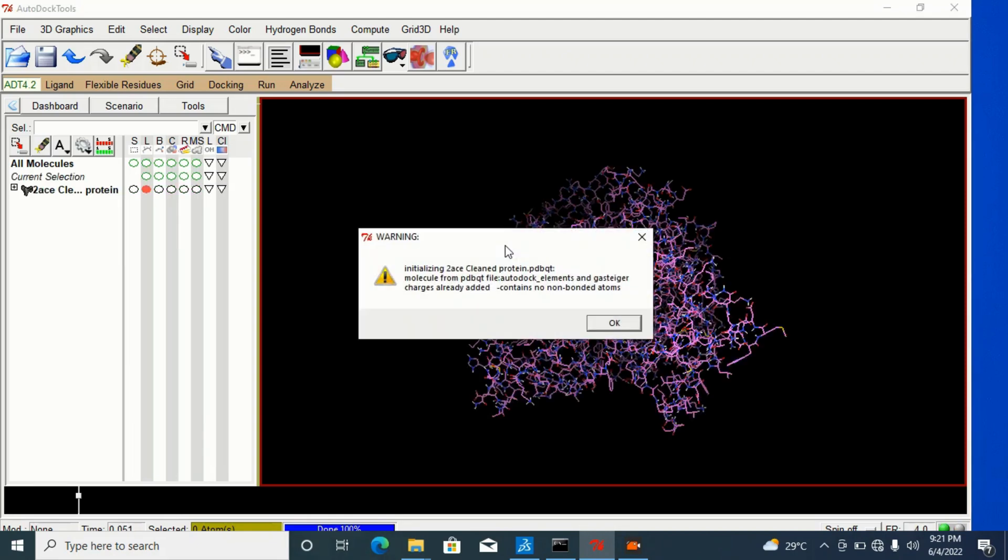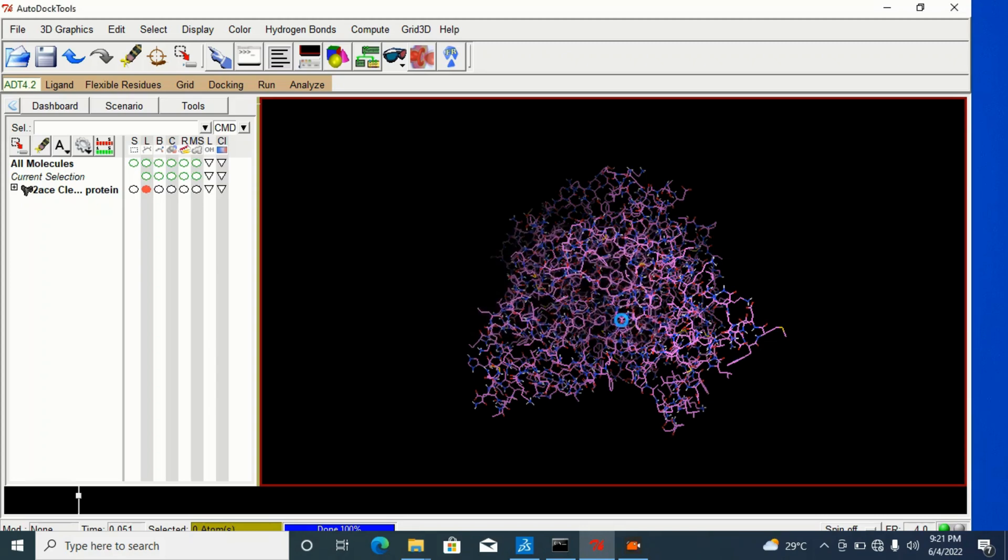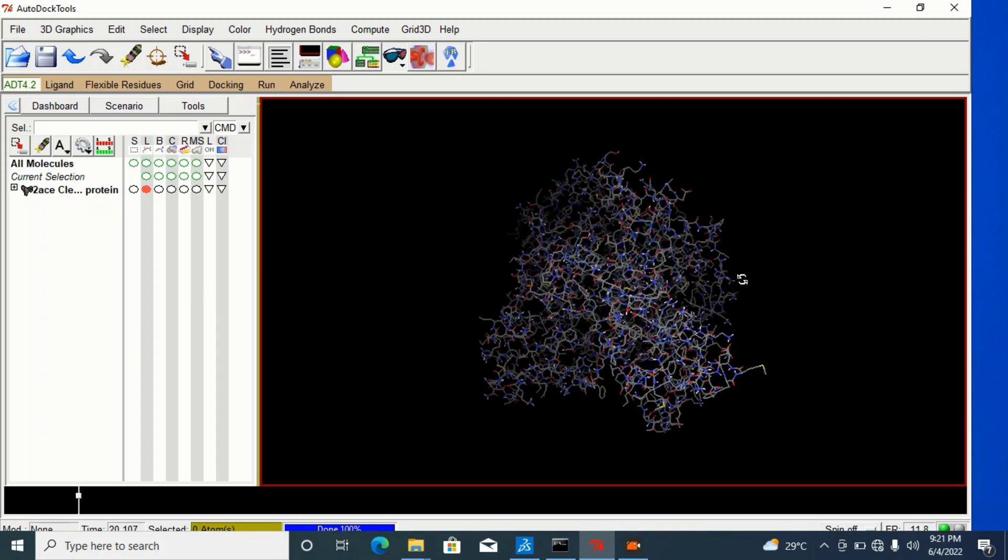It will ask me if I want to retain all I have already prepared about this particular protein. I will tell it yes. And it will still give me this option saying that this actually contains no non-bonded atom, which is fine. I have already prepared that for this before. So, I will say okay. Then this is my protein from what I have prepared before.